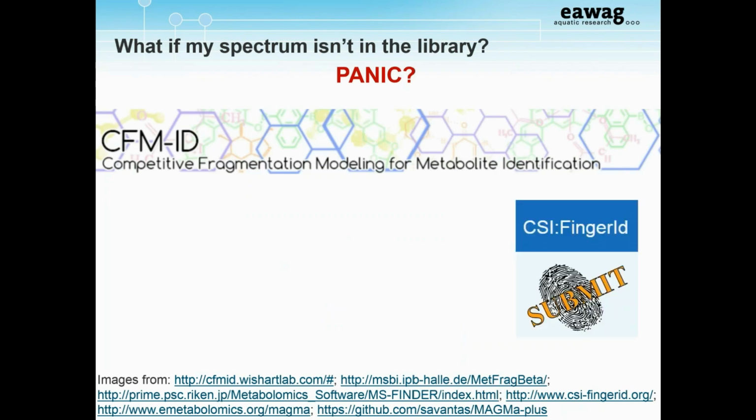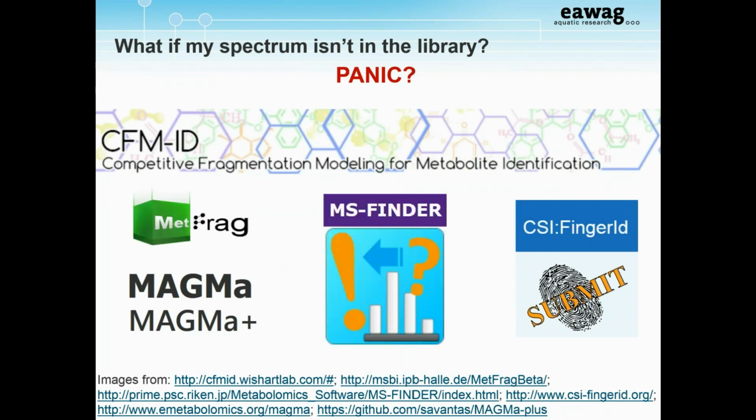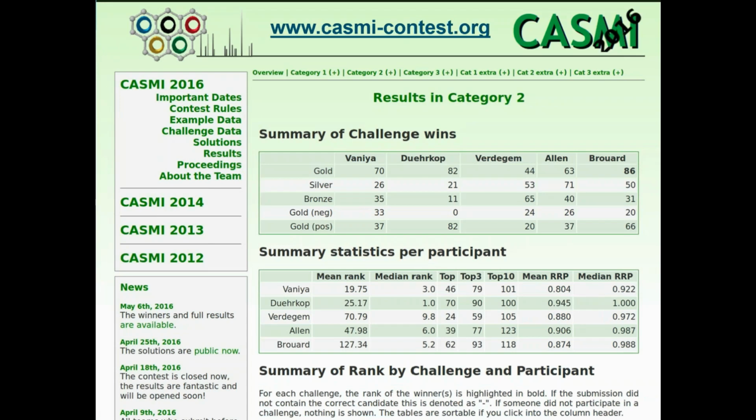We've also got CSI:FingerID, one of the newest ones out there. MAGMa, MAGMa+, MetFrag, and MS-FINDER. There are also several more resources. I've only mentioned these ones because they were the ones that participated in the CASMI contest this year.